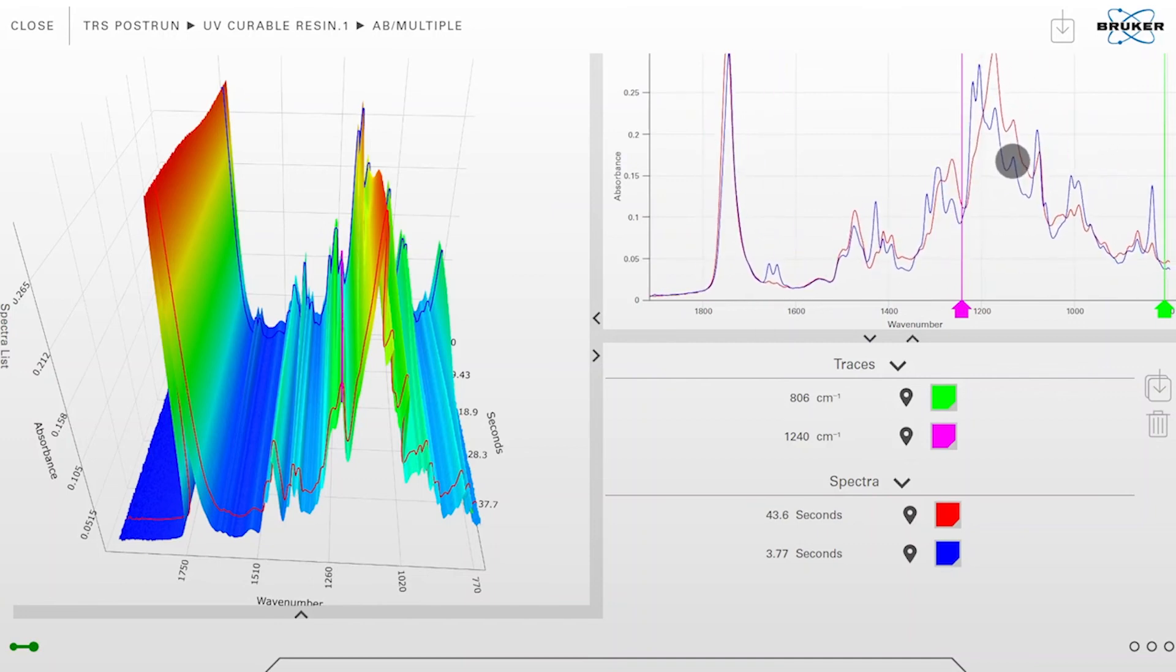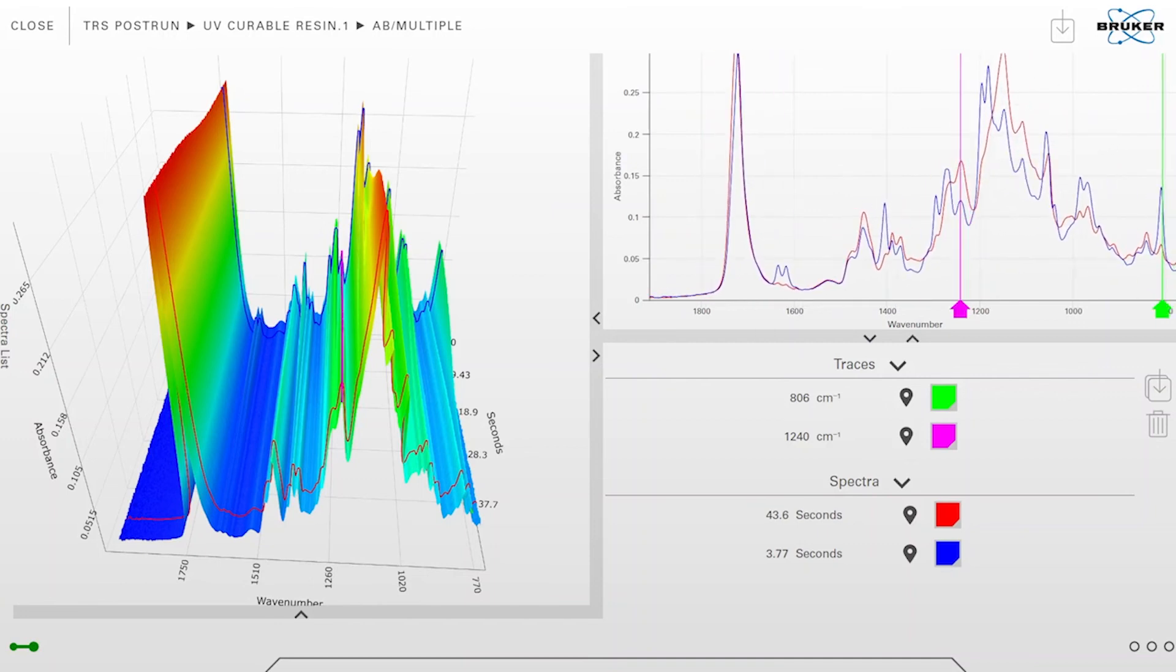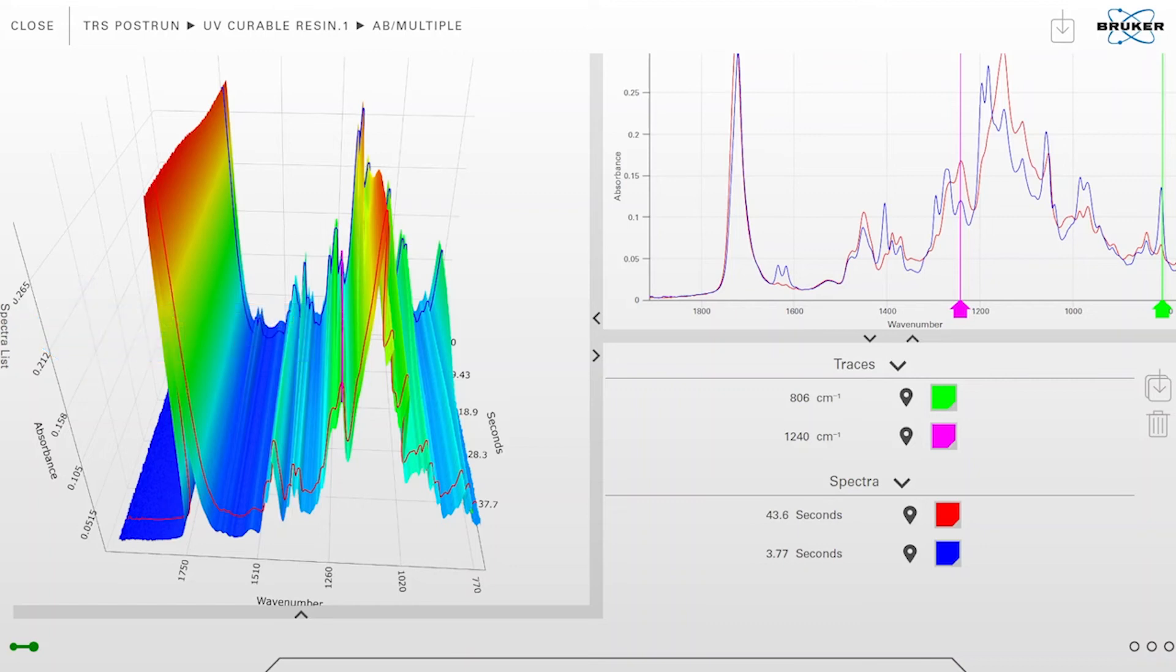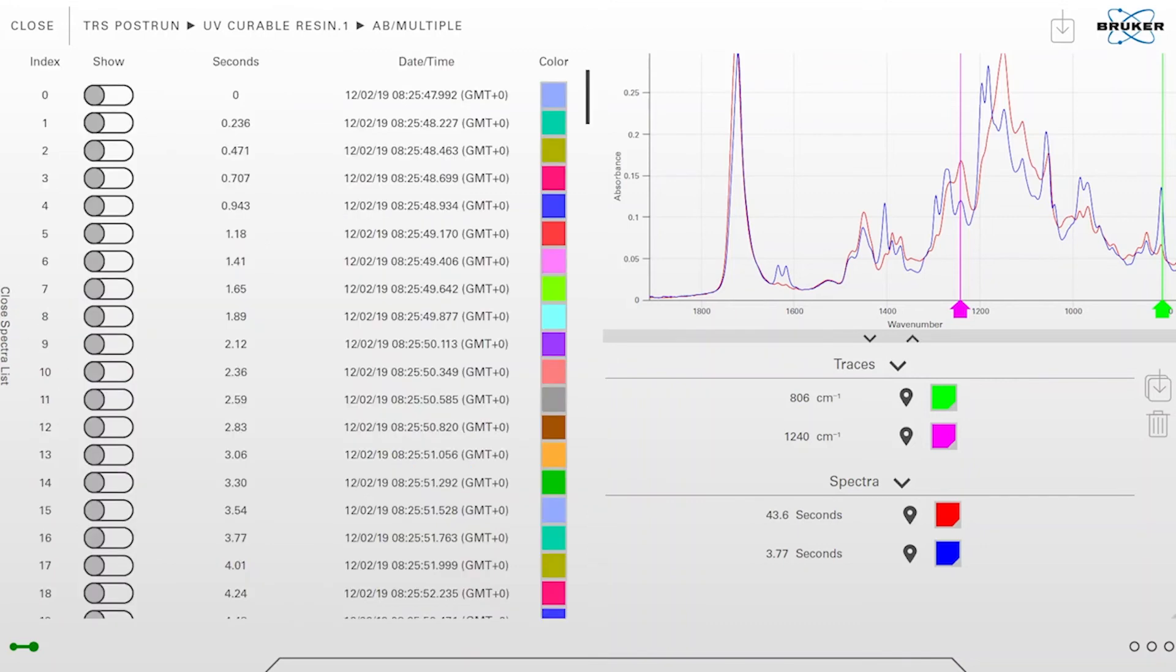If we want to visualize additional spectra in our 2D view on the upper right corner, we can open the spectra list which is located on the left side of this view. With a click on spectra list we open it. This spectra list contains all individual spectra which are measured in this case, and these individual 2D spectra are then stitched together to the 3D view which we could see prior. Now we can move around this list.